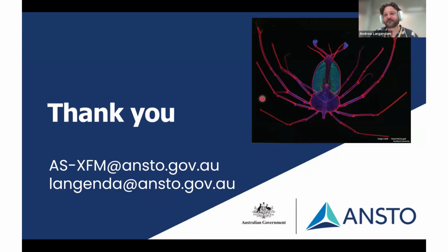Yeah, I guess I'm interested in analysing some mine waste samples. And I was just talking to Olivia about this yesterday and looking at how critical metals like cobalt go between primary phases like chalcopyrite and pyrite and into secondary phases. So is that something that you can look at with XFM, like do maps of jarosite or secondary salt phases and that kind of thing?